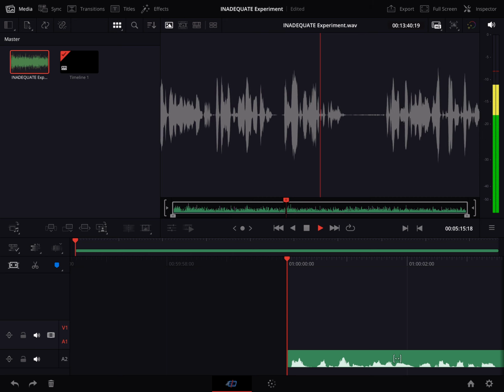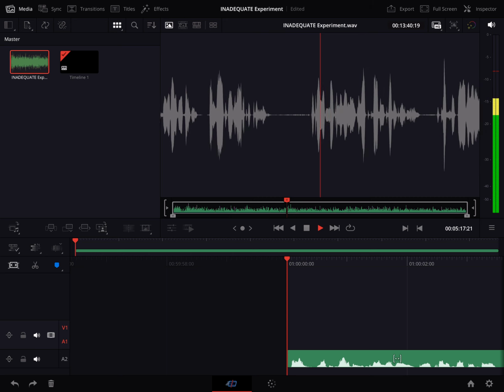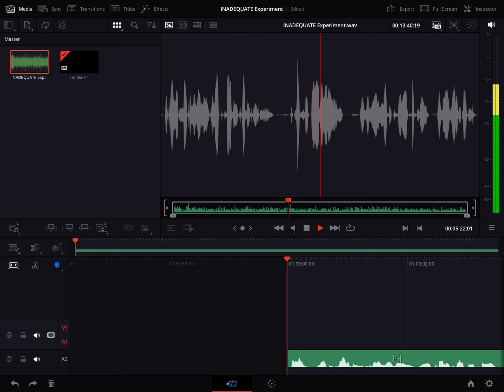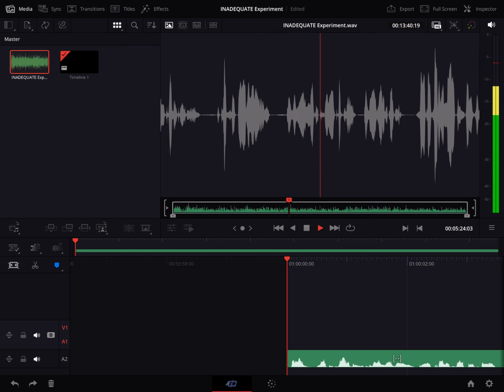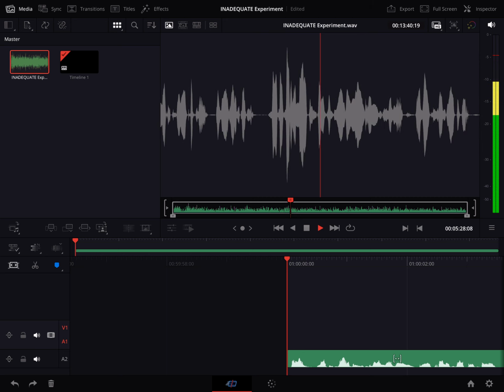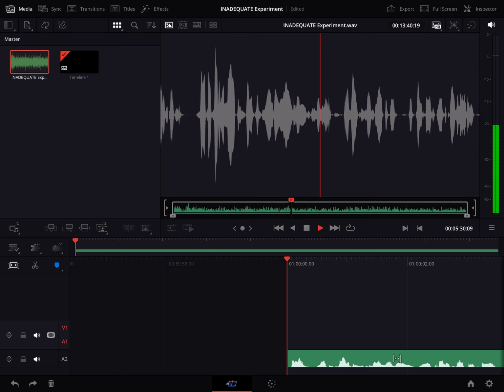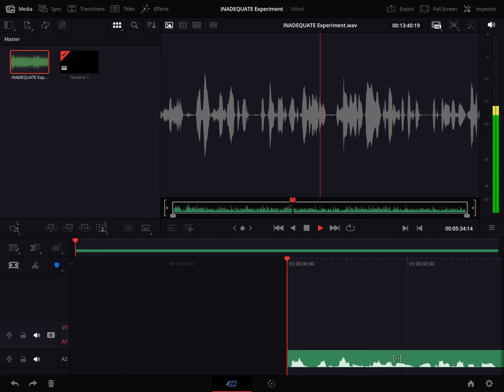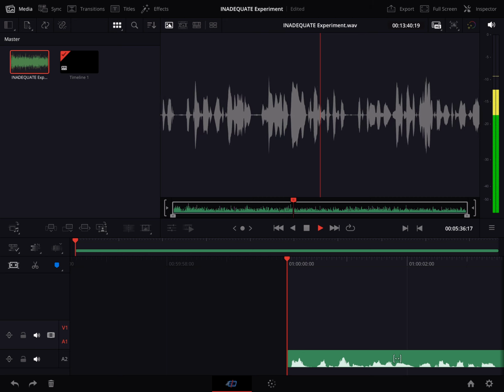And that's where inadequate comes in. Because it focuses on those direct carbon-carbon connections, it cuts through all the noise and gives you a much clearer picture of the overall structure. So it's like having a map instead of just wandering around aimlessly. Exactly. And a very precise map at that. It pinpoints each carbon atom and shows you how they're all linked together step by step.